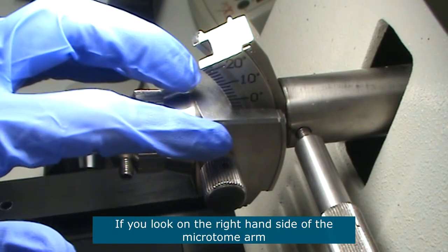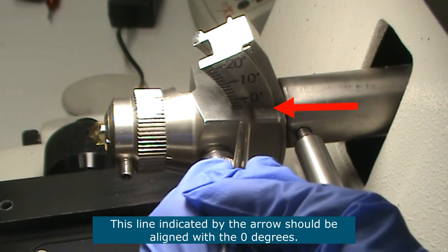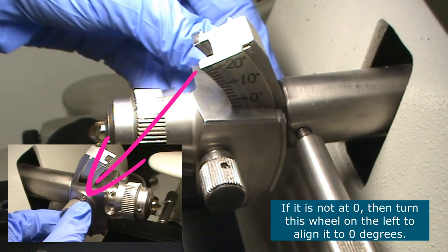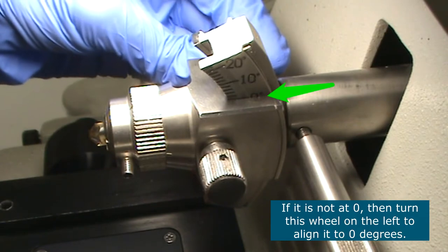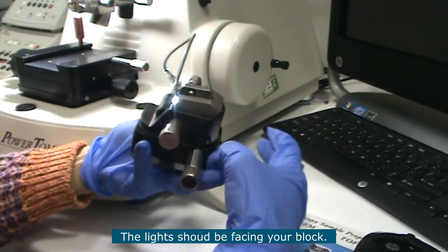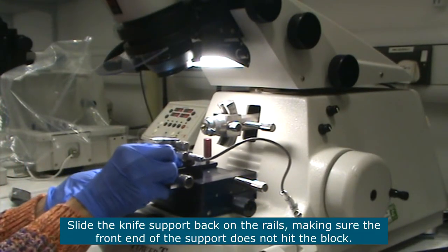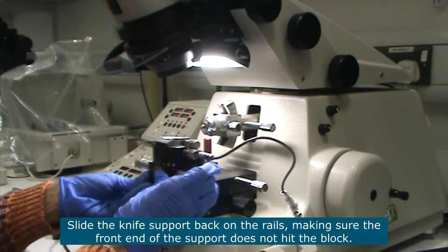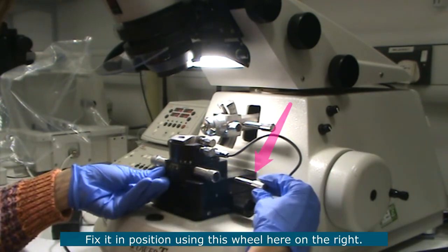On the right hand side of the microtome arm, this line of this metal piece should be aligned with zero degrees. If it is not, on the left hand side you can turn this wheel and align it to zero. Now bring the knife support back in — the lights here will be facing your block. Slide it back into position making sure that this end does not hit your block, and then fix it in position using this wheel here.